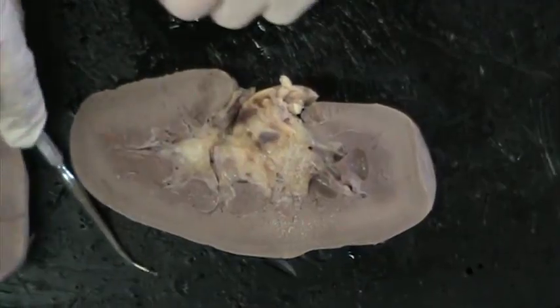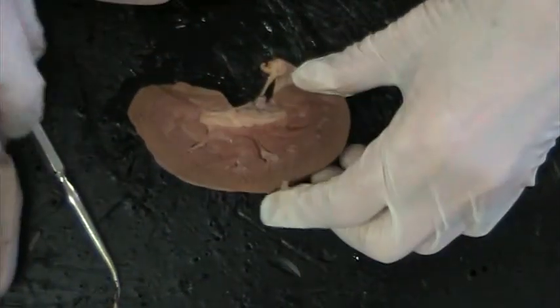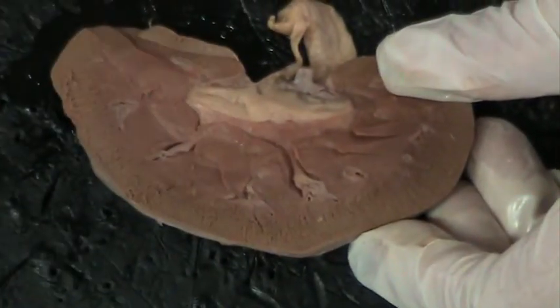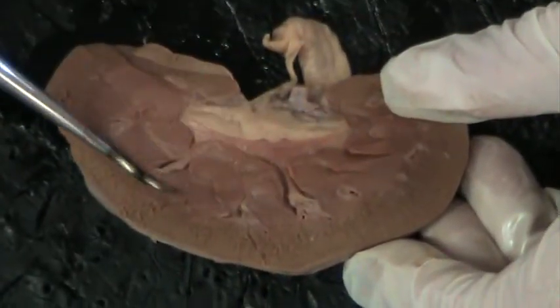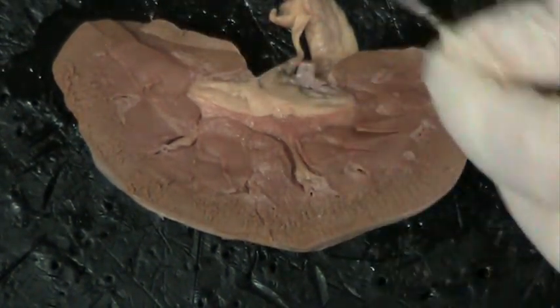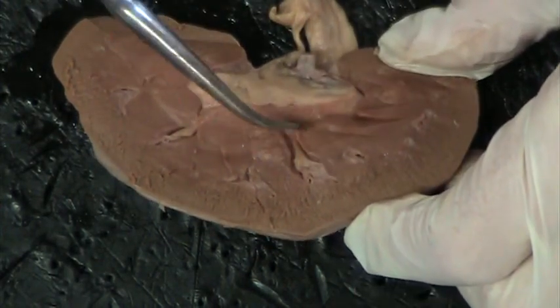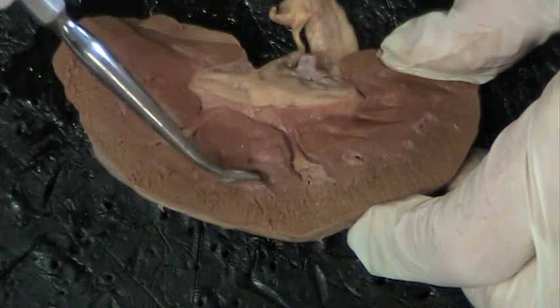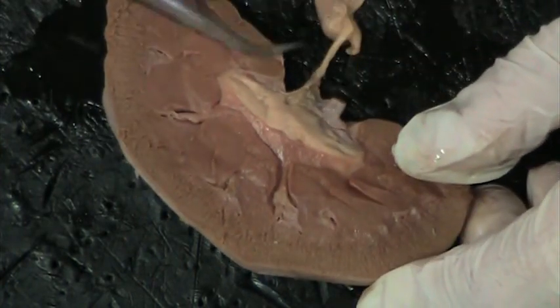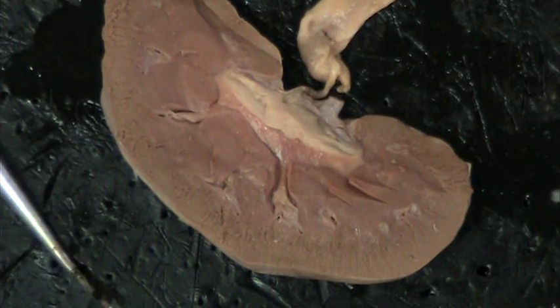And if we look at this little guy, I don't know if you can see the parts any better. Maybe this side is a little bit better. But again, you have the cortex area, the outer border, the medulla, and in here you have the renal pyramids, and in between them the renal columns. It goes up the renal columns and renal pyramids, and that's where that whole collection system is. And this one has a little more ureter, almost cut off on it. But that's the structure of the kidney, and I hope this helped.